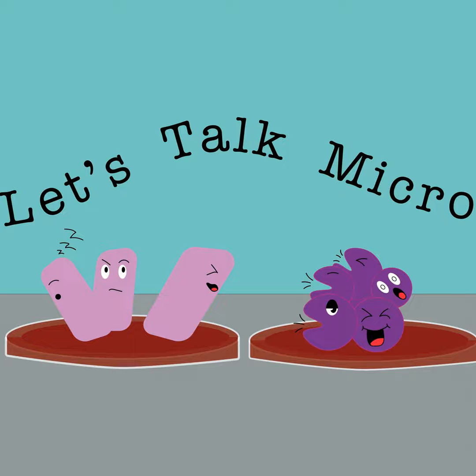So they got microscopes, they got kits, they got prepared slides. They had some in-house made slides that we sent them home with. And they did some staining procedures using methylene blue and prescribed procedures so that everything would be safe. They did not use any live bacteria. They were not sent home with live bacteria, but they could take specimens from their homes. So yogurt, kombucha, soil. I sent them out to get pond water one day.